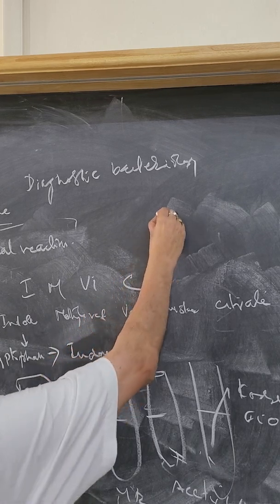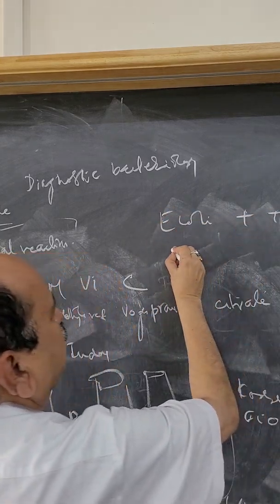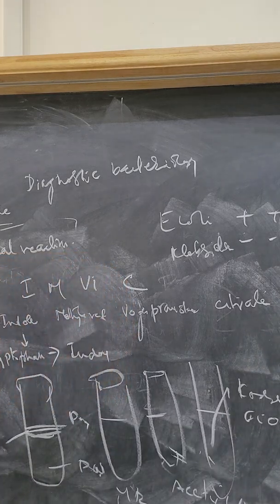So E. coli is plus plus minus minus, Klebsiella is minus minus plus plus. These are very important questions asked in your exam. IMViC comes as a short note, MacConkey comes as a short note, and organisms causing urinary tract infection come as that route. Collection of the urine, midstream sample of urine: the first few drops should be avoided, the last few drops should be avoided, and only the middle part should be processed.